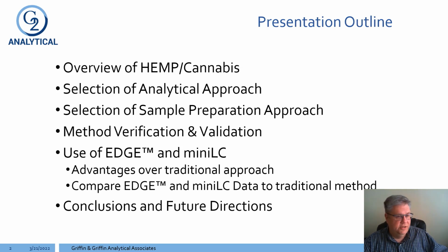I then want to discuss the selection of both the analytical tool and sample preparation tools that we will have, specifically for the analysis of cannabinoids. Then I want to change a little bit and talk about method development. Method development follows the selection of your tools and sample preparation. If you're lucky, you can find a method that's already developed.